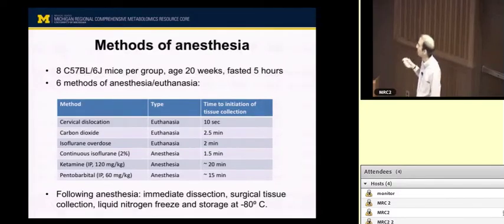It's very commonly used, although it's becoming somewhat more controversial in the literature. If you read this sort of literature, CO2 is a very common way to euthanize mice. It takes about 2.5 minutes, and a lot of people will use that to euthanize their animals before they collect tissue for gene expression analysis or for protein analysis for Western blots, et cetera. So this is very commonly used. You can immediately start to think, CO2 exposure, metabolomics might not be a good combination.